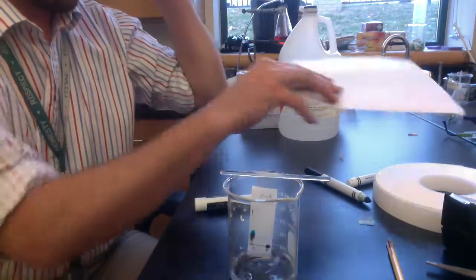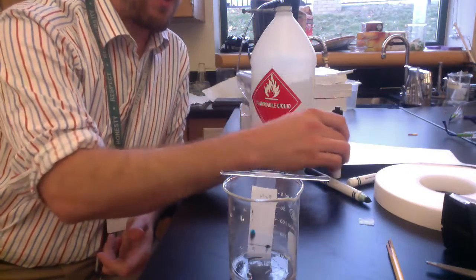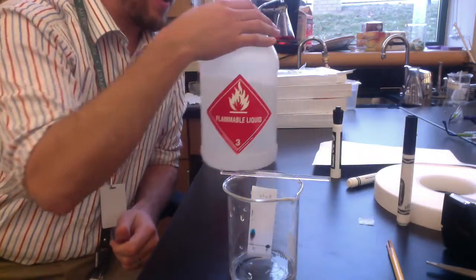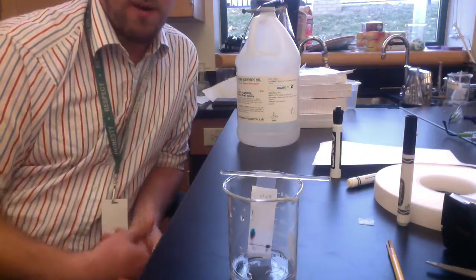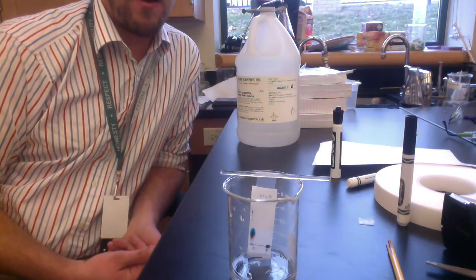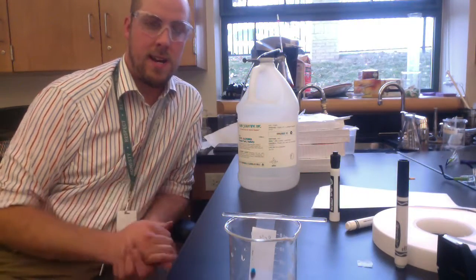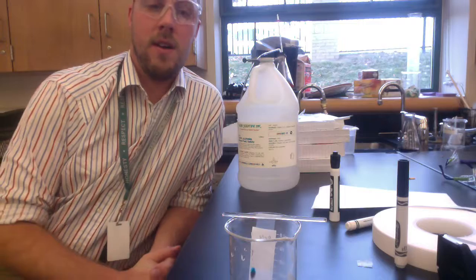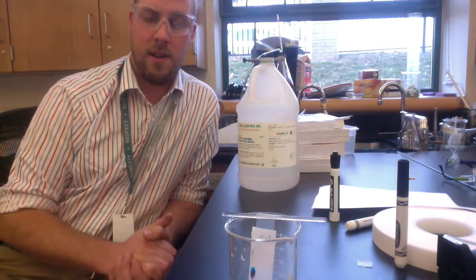And this is the short version of this, but what you are going to do then is test different pigments, so different colors, different types of pigments, whether it's washable or permanent or dry erase or wet erase, and then test that in different solvents like ethanol and acetone. We'll continue this on Monday. I've got groups for all of you, and then on Tuesday you're going to have to identify an unknown, just like with the flame test lab. You had to use your data to identify the identity of an unknown substance. You're going to have to identify the identity of an unknown marker based on its chromatography, or based on how it reacts with different liquids.